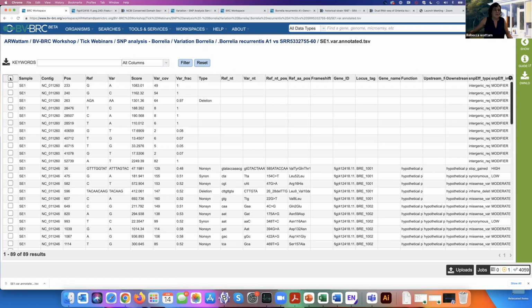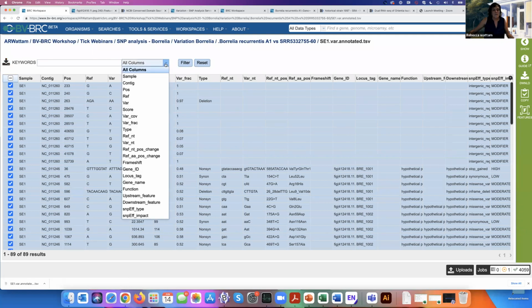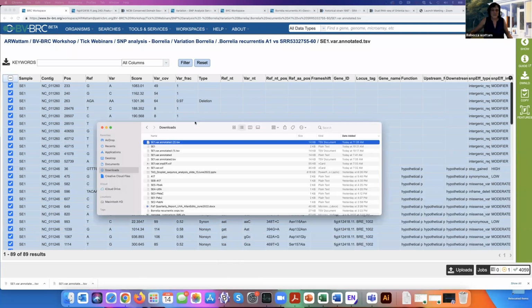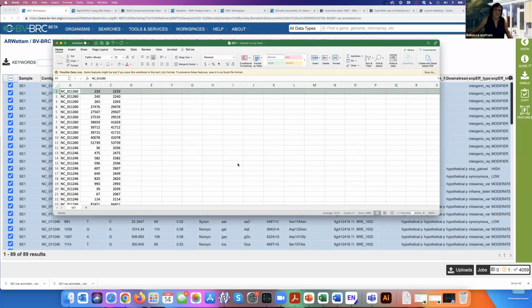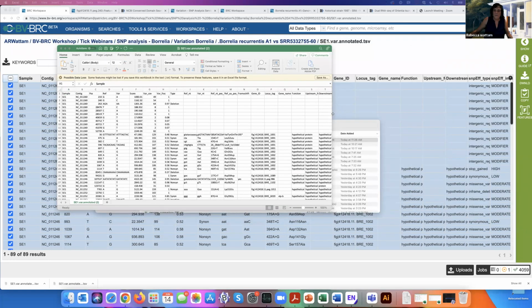So I would click on this, and well, I can download it here. Also, I should point out that you can filter on the data here at this point. But let's download this thing. And then I always show in Finder. Oh, Finder's over here. Sorry, it's on my other screen. And I'll open that with Excel. Hopefully it'll open. Oh, this is the way I did it. This is the previous one that I was playing with before.